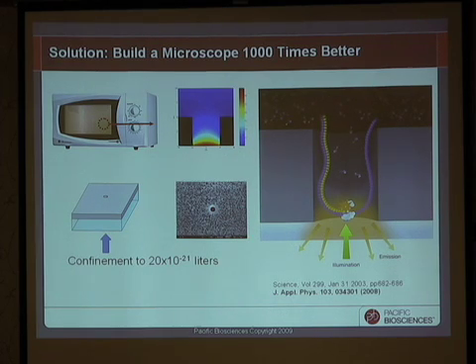We did that by borrowing a concept from classical electrodynamics known as waveguide transmission below cutoff. This is a concept that's very familiar to all of us. It's at work in the door of an ordinary microwave oven. If you look carefully at your microwave oven door, there's a metal screen perforated with holes about 2 millimeters in diameter. They're there, of course, to let you see your food, but the real function of the screen is to prevent the microwaves from coming out and cooking you while you're peering in.